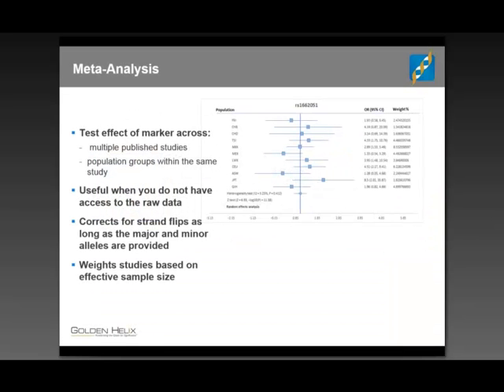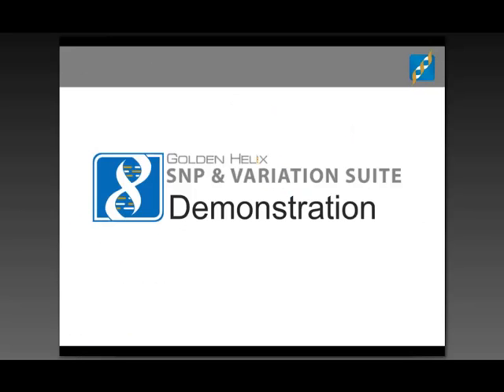So that was a quick overview of K-fold cross-validation and genomic prediction in SVS. Again, we technically have 2 different types of genomic predictions. If all of your data is in one spreadsheet and some of your data is missing for your phenotype, you can run a single GBLUP or Bayes-C/Pi to predict those missing phenotypes. Or, if you have all of the phenotypes known for a certain set, you can run K-fold on that set and then apply the prediction model to the set that's missing the phenotypes, and that's the second way of running genomic prediction.